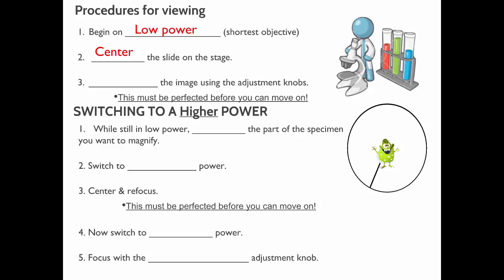They have these two knobs. They're called the mechanical stage. The front knob, when you twist it, moves the slide left and right. Okay? The back one moves it forward and backward. So you don't have to move it around with your hands. You just twist these knobs, and you want to get it so that the specimen you're trying to view is right in the middle of the stage, right where the light is shining through. Okay? So you set it up there.